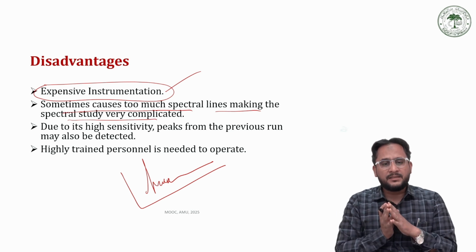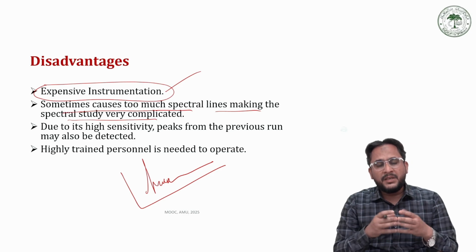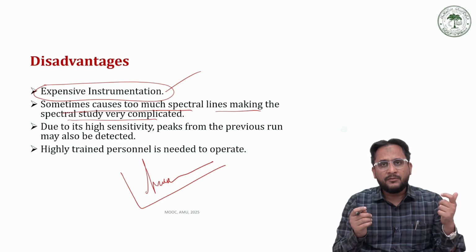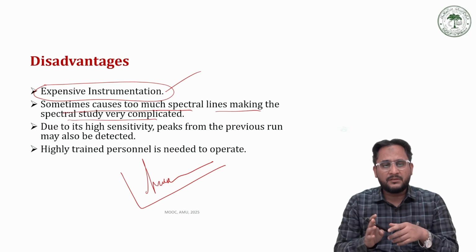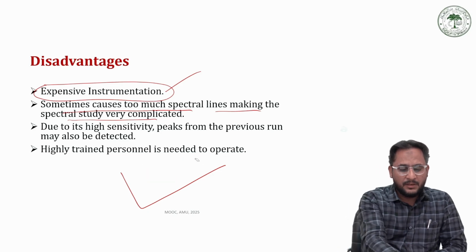Further, due to very high sensitivity, peaks from the previous runs are also detected. So every time we have to flush it out with pure solvents, so that we do not have excessive peaks from the previous run.